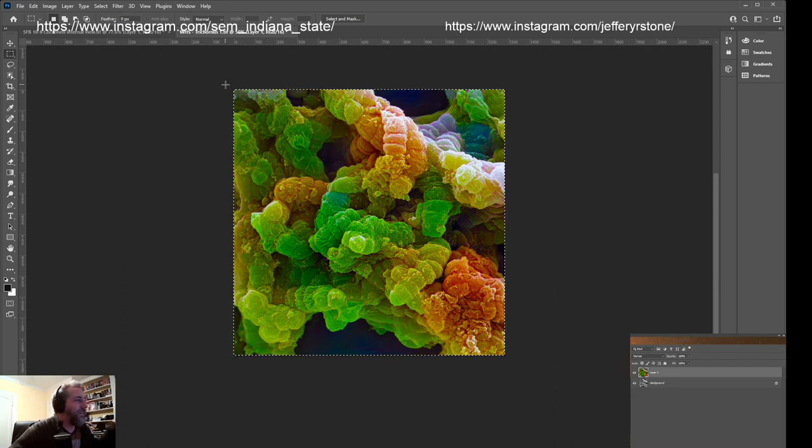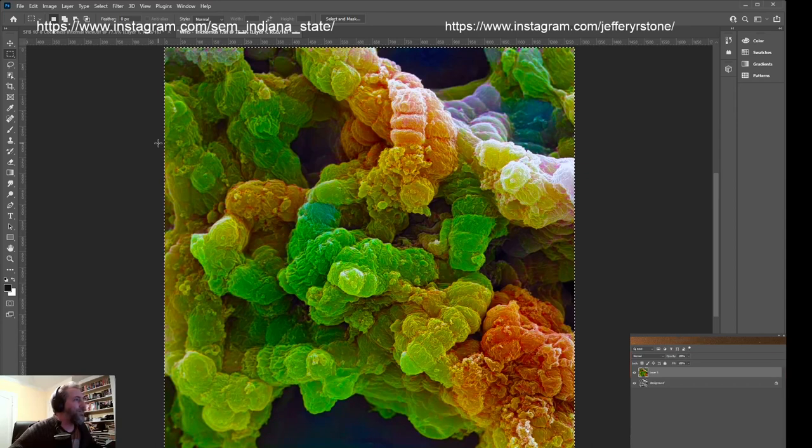So she's collected these samples and then she sent them to me. I put them on the SEM, and then we're doing two things with them. One, they're doing a little art show at the university to showcase the art that we've put together. And I've actually done a bunch of these already, where I colorize them. That's step one, we're doing it on a local scale. And then step two is we're going to take that and expand it up to an actual art installation at the White Sands National Park. So this art will then be ramped up and ultimately put into some sort of a display there.